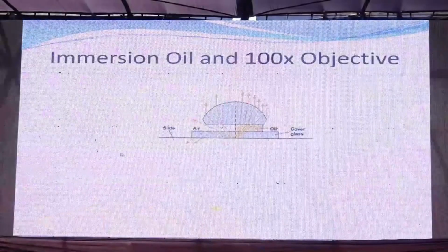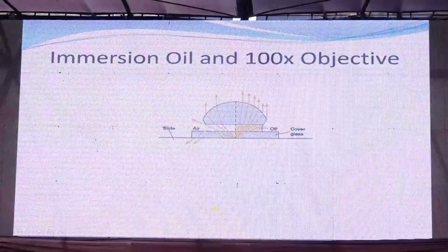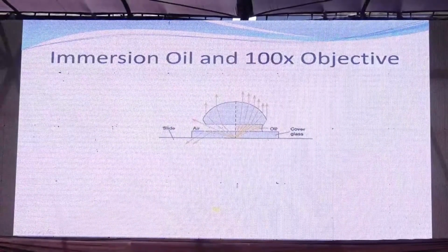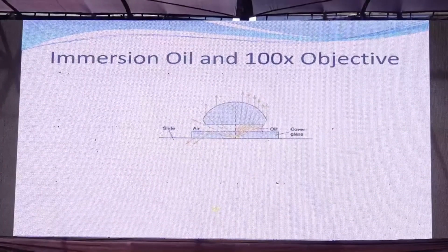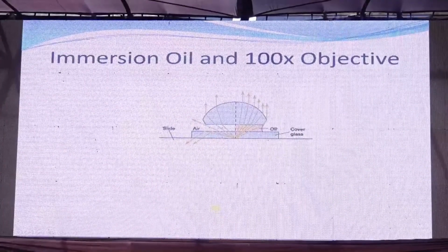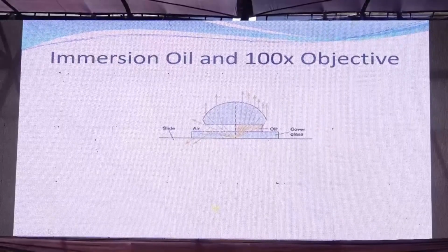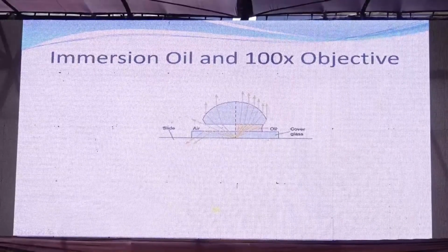And when you go beyond it, say 100x, the working distance shortens further. And we put a drop of oil, that increases the refractive index, the number of rays entering the tube increases manifold, and we get a better picture, better resolution, better magnification by the microscope.